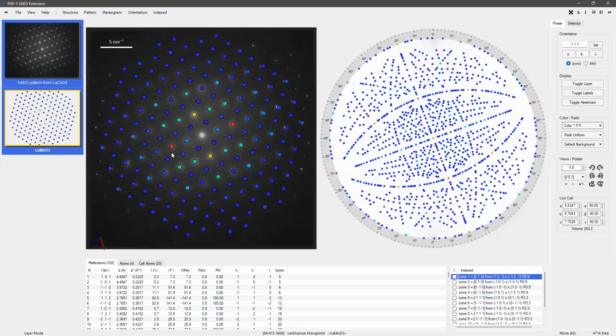When we use the Shift, Control, or Alt key, just press any of them. I always use the Alt key. I can now click any of these points here in order to show some vectors in the image, which show the distances and angles between those vectors, right? So these vectors usually will stay there.